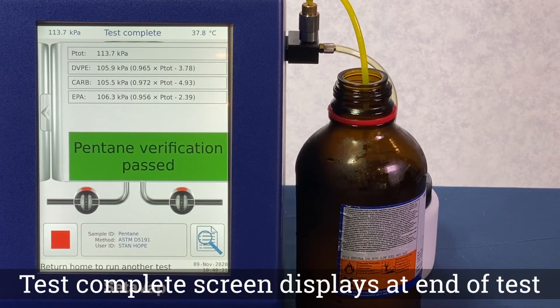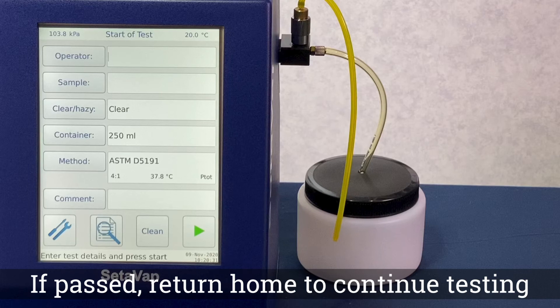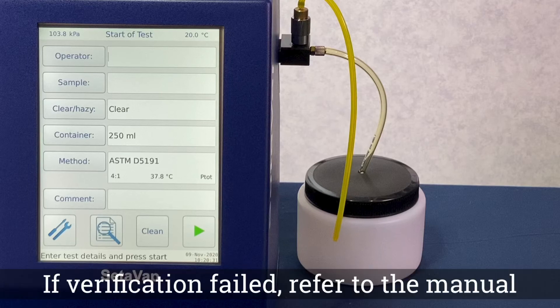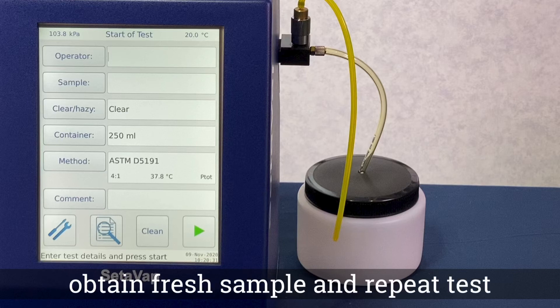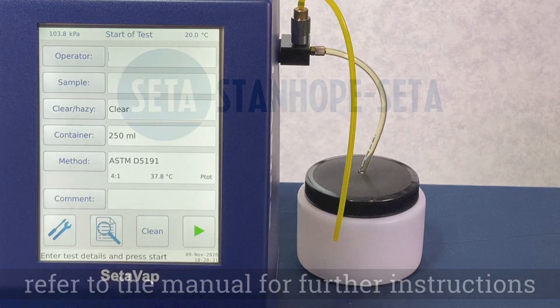Once the test is complete, a verification passed or verification failed message is displayed. If passed, return to the home screen to begin further testing. If failed, refer to the manual for cleaning instructions, obtain a fresh sample and repeat the test. If verification fails a second time, refer to the manual for further instructions.